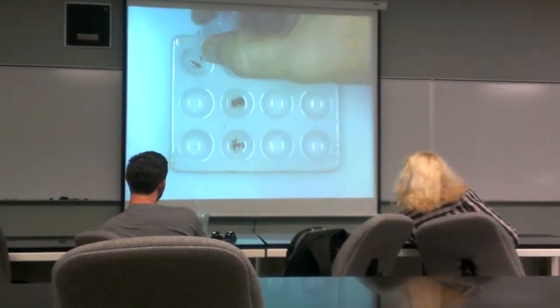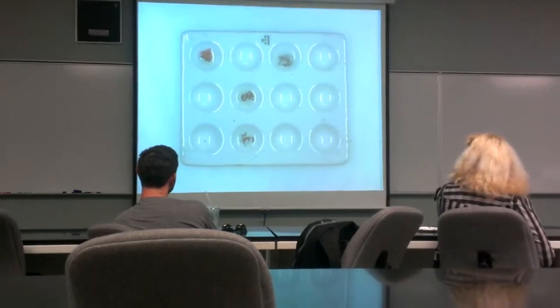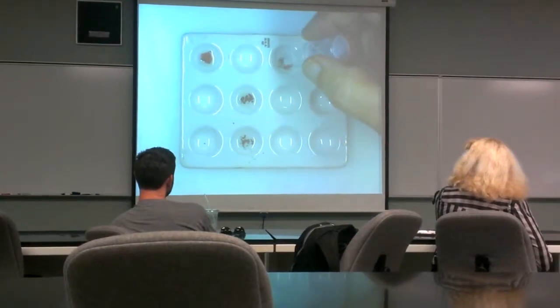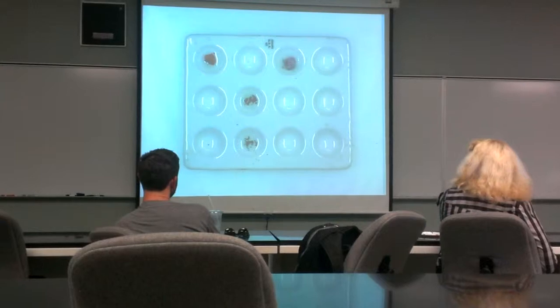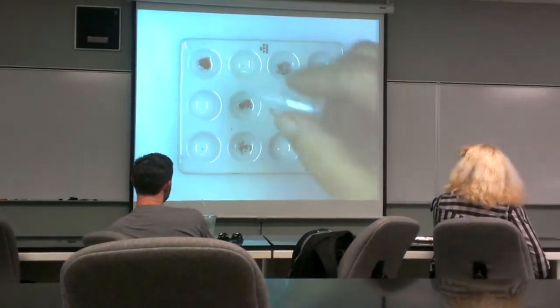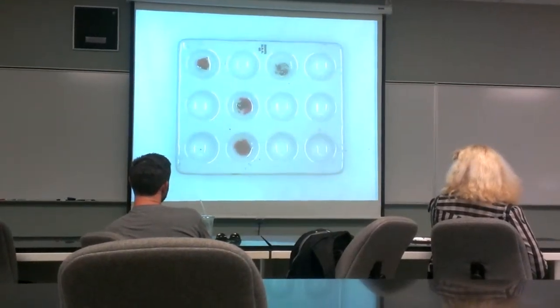I always use one control. See pink? It turned pink. So hey, that's a great meteorite. Okay, I think this again is Gibeon. That's the stuff you gave me too. Pink. Yes, the sample. That means it's meteorite. Okay, let's cross our fingers and see these unknowns. Oh! It's a meteorite. OMG.